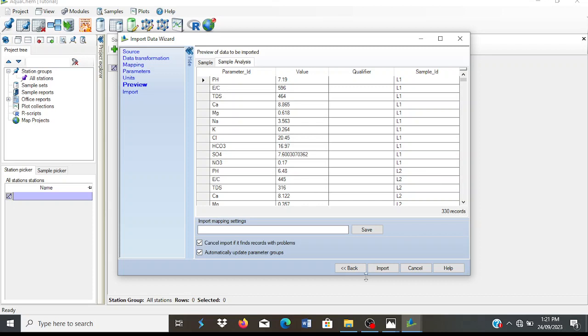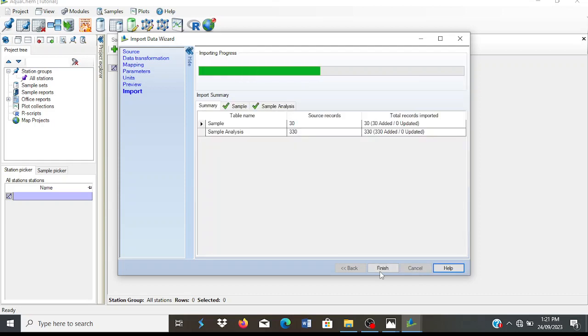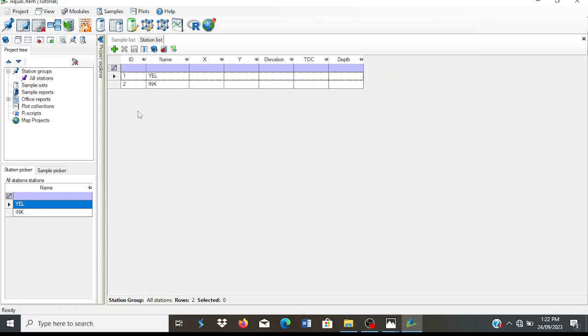There's nothing much to check here. If your files are already placed very well, you don't have a problem. Then next, and that's going to import. Just watch it do that successfully. You finish it. Then when you finish it, you come and check around just these two.